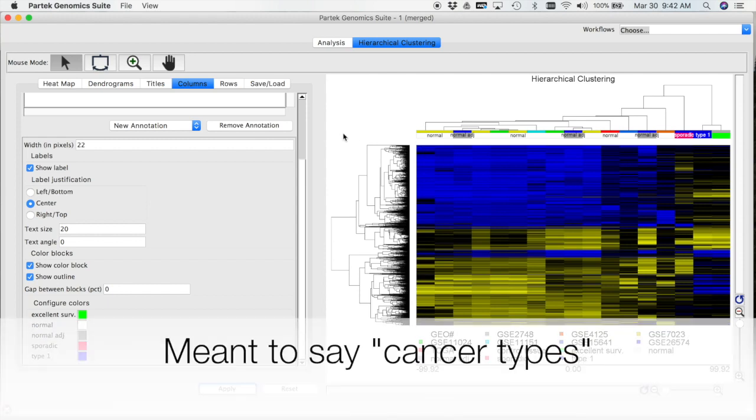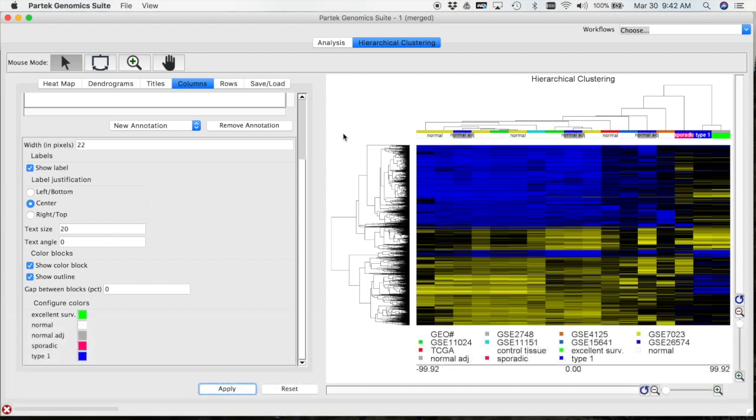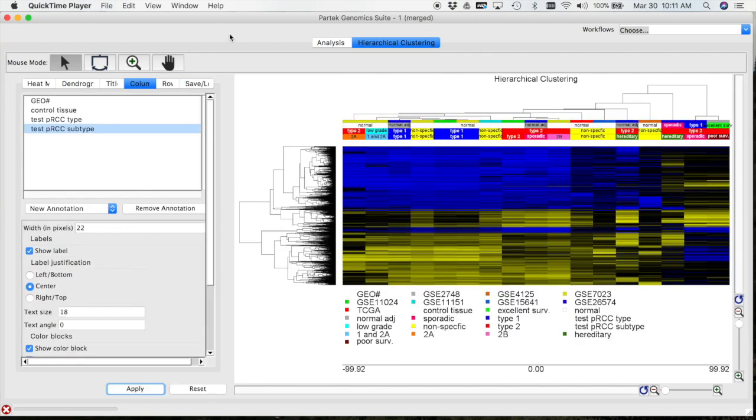So you should see an edit and the labeling will be there. And abracadabra, here is our labeled heat map. Our genes are clustered in the rows based on the parameters we clustered them with. Our comparisons are all in the columns, and again, they're labeled.